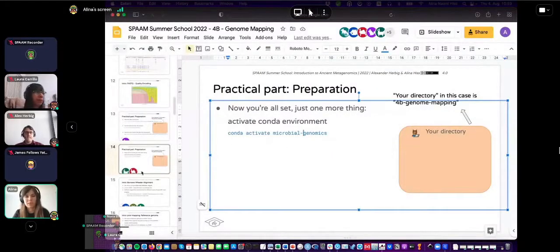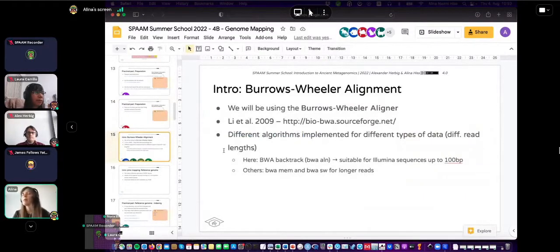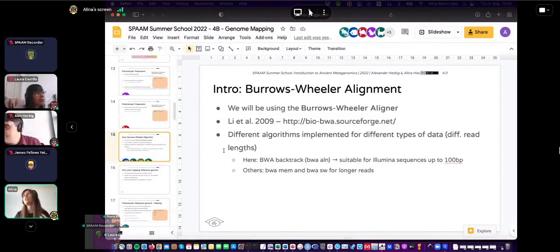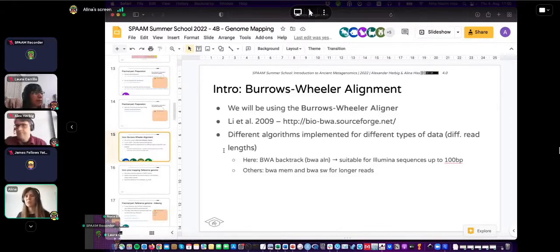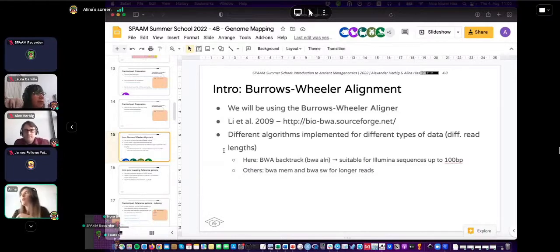We have activated our microbial genomics conda environment. For mapping, we are using the Burrows-Wheeler Alignment tool (BWA). There are different algorithms for different types of data — for very long DNA fragments you'd use a different one. Since we are dealing with ancient DNA and short reads, we use BWA backtrack (BWA ALN), which is particularly suitable for sequences up to 100 base pairs, and we are usually well below that.